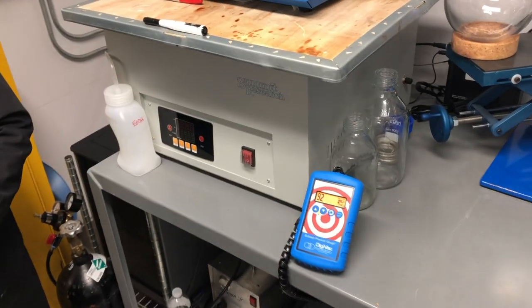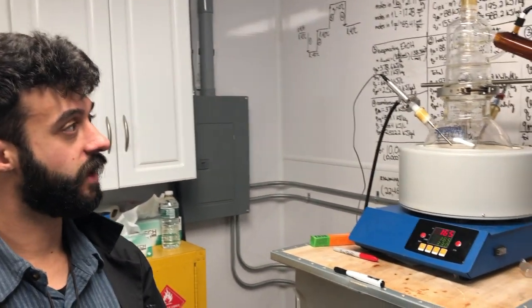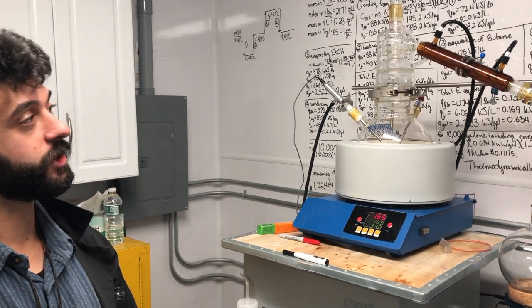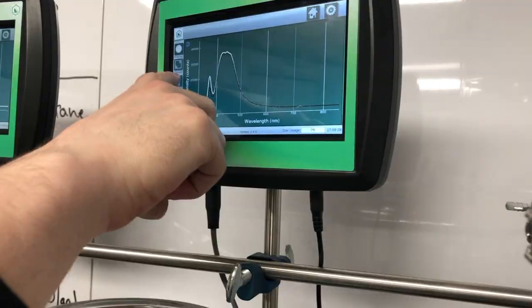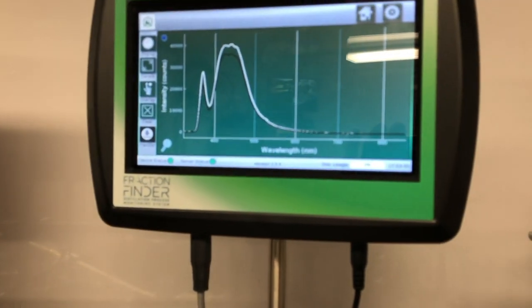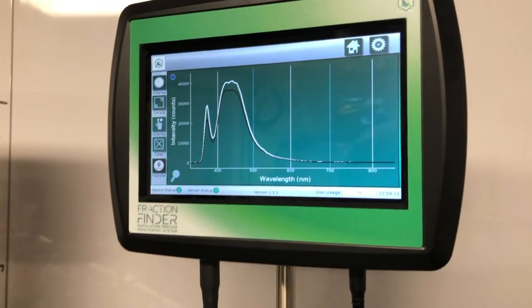We're just going to keep working through this heads fraction until we really inevitably see that heads line hopefully go down, or at least stay similar intensity while the cannabinoid peak drops, and then we'll start pushing into the last part of heads. Look in the flask right here, we still got a good bit of material. We're probably just going to push it into mains now. So we should see an increase in the 460 to 410. Oh yeah, you're seeing the 460 increase to the 410, just ever so slightly right now. It used to be on the same level, now just ever so slightly higher.